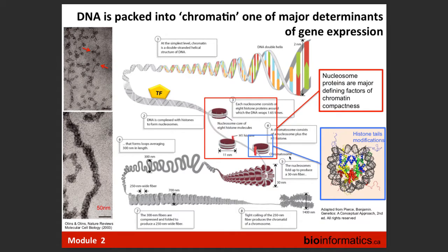And this may be almost redundant because Martin already showed a lot on the biology of what we are studying with ChIP-seq data. Here just a few comments. There are several flavors of ChIP-seq data. One, which is what we started with, is transcription factor DNA binding.